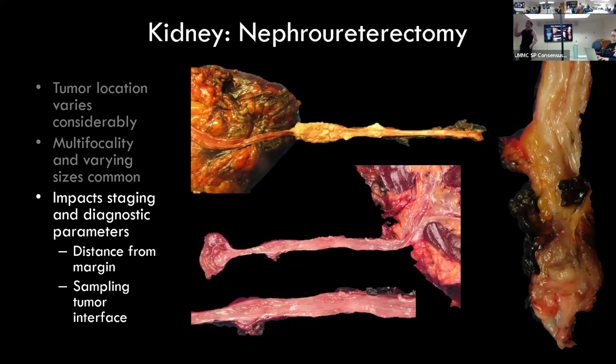Okay, be aware that urothelial cancer can look deceptively innocuous, right? So would you please point again in the lower picture where the cancer is? It's over here. Okay. Yeah, it might be difficult to see, but that's what it is.